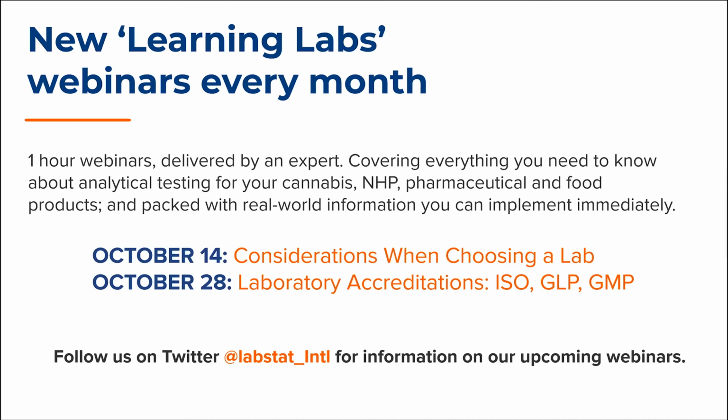If you look at the USP, the United States Pharmacopoeia, or even the European Pharmacopoeia, they have requirements for what they call suitability. This is where you show that the prescribed tests of the USP are suitable for your particular matrix. So there's not necessarily a validation, it's more a demonstration of method suitability.